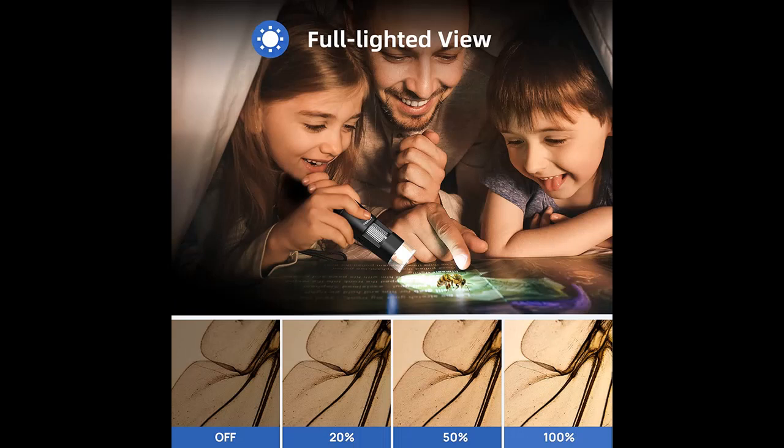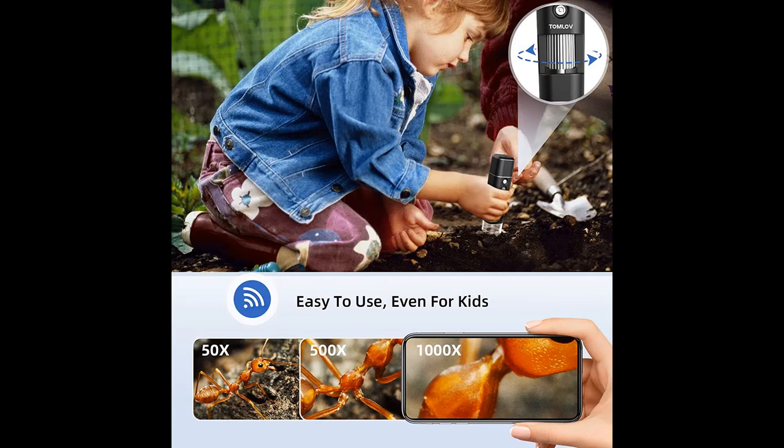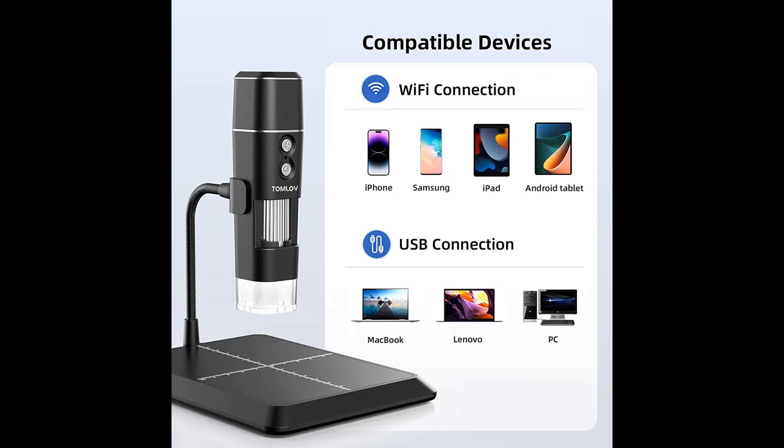Easy to set up and use, with seamless connection with iPhone, iPad, Android phones and tablets, and USB connection with MacBook/iMac and Windows PC. A free app is provided for iOS and Android. PC uses the default software Photo Booth for MacBook/iMac, and Windows Camera.